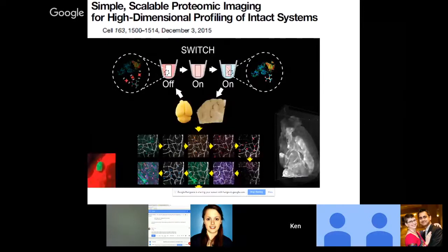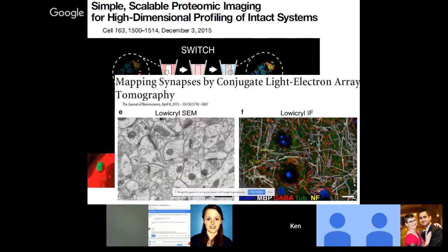And it is important to understand that glutaraldehyde is also known to preserve the primary structure and relative locations of most proteins, as papers like this and this one describe. The key point is that glutaraldehyde fixation is simply the best method known to science to preserve both the structural and molecular information across an entire brain.